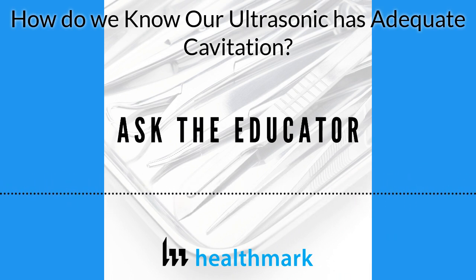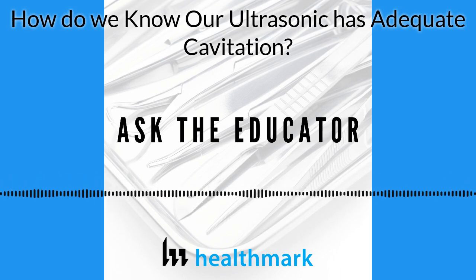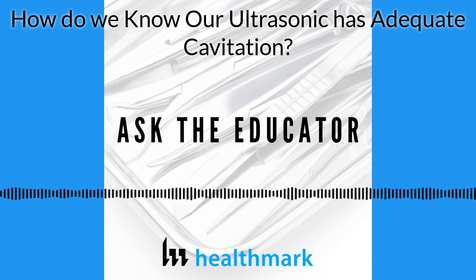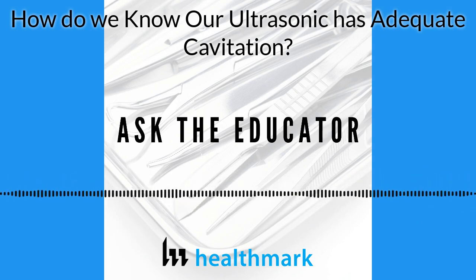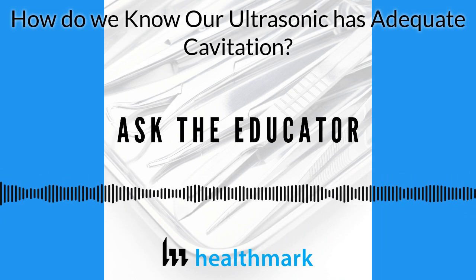Factor 2 comes into the amount of mass or metal that's in there to begin with. It has to raise and lower, and it already has a basket in it. So we know the more mass you have, that also decreases the amount of cavitation energy that can be detected on each level. And here's the third one.